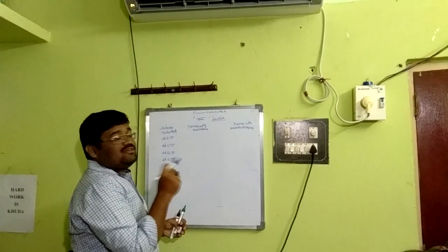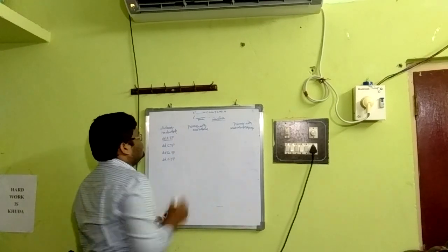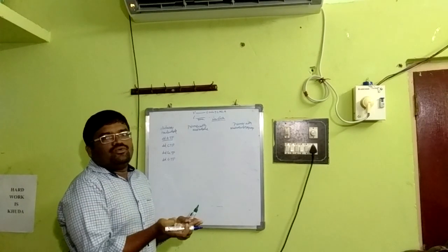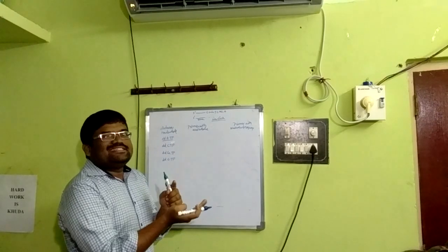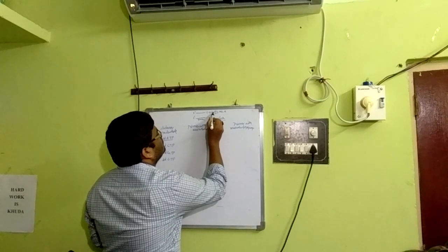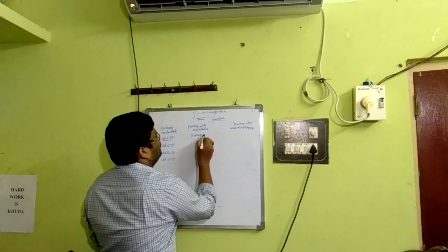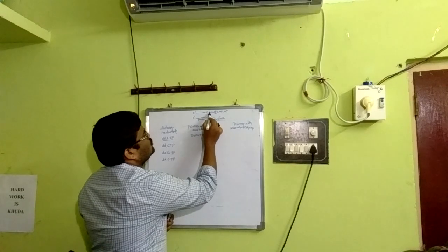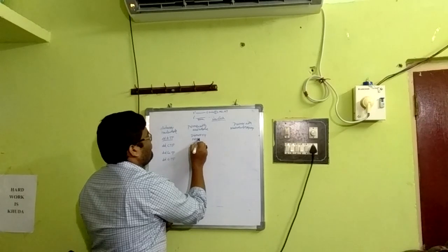This is a very important point. For example, ddATP, that means a dideoxy A residue. When it comes into action, the chain will get terminated. The complementary base pairing is T. For example, here the T is here. That means after 1, 2, 3, 4, primer plus 4. Another possibility, after 1 to 9, that means primer plus 9.